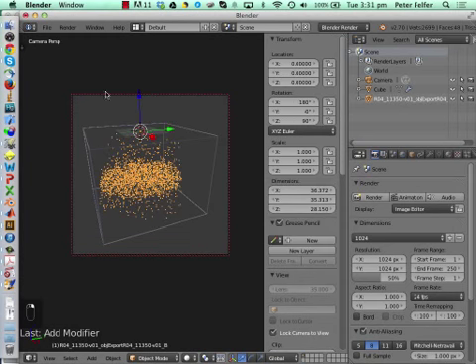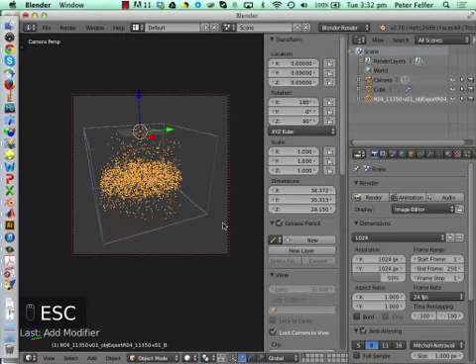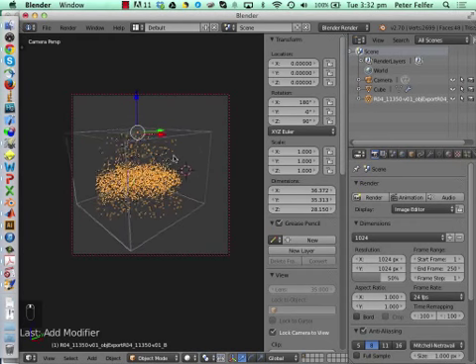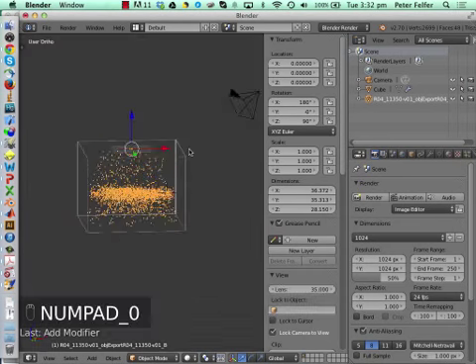Interesting. Oh, because we haven't got it selected. If we select it and render it, okay, it doesn't. Maybe because we're in object mode. I've done renders with the OpenGL this way. Anyway, forgot how. So we need to have actual objects that are representing our atoms.